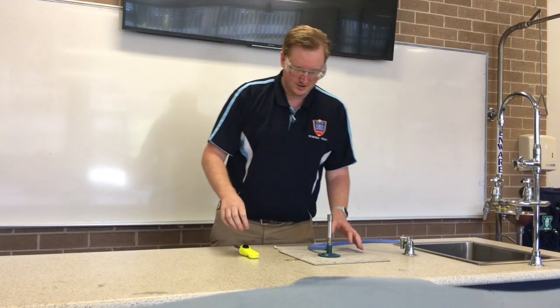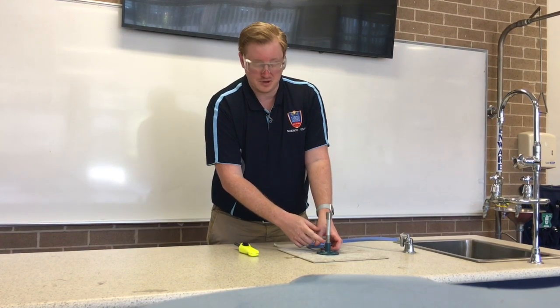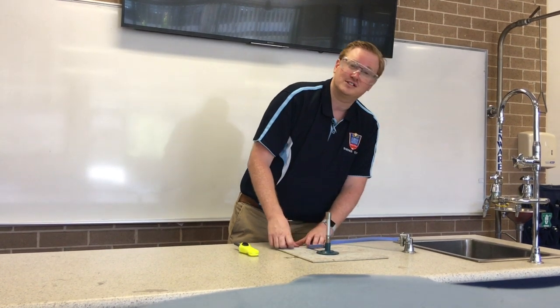Once it's on there nice and secure, you're going to have a look at the collar on the Bunsen burner and turn it so the holes are closed.